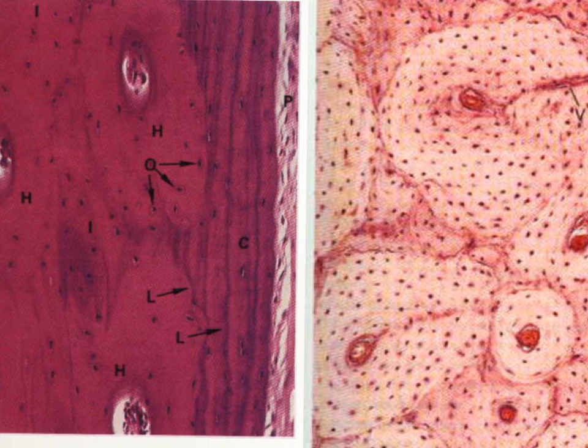This picture on the right side demonstrates the decalcified compact bone, as it is stained, and this label here will be the Haversian blood vessels. Why do I say Haversian blood vessels and not Haversian canal? Because the decalcified compact bone section does not contain calcified tissue, only the living tissues, so you should say Haversian blood vessel.